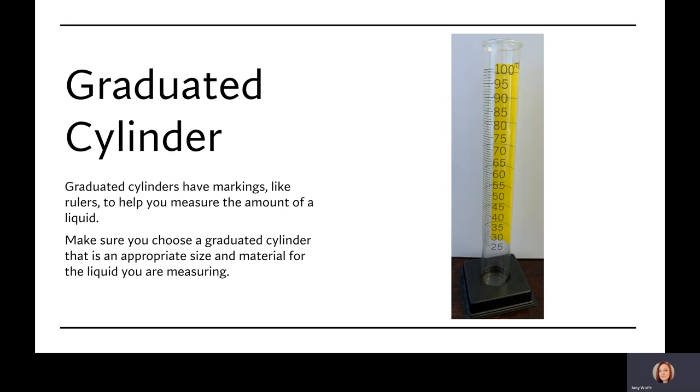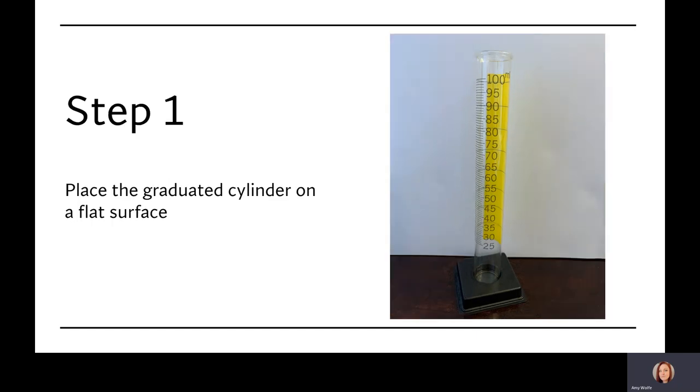To ensure our readings are accurate and we have a safe working environment, the first step of measuring is to place a graduated cylinder on a flat surface.